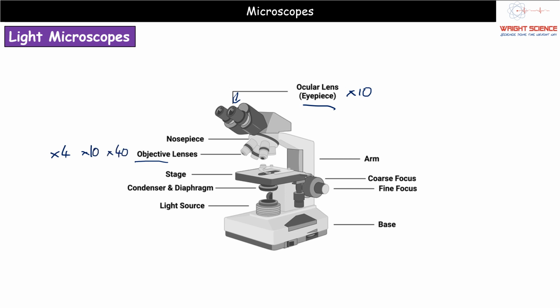They can have different ones, and particularly if you are doing things that require you to see a greater magnification, then we can obviously have more powerful objective lenses on there. The little bit that we put our microscope slide on is the stage, and hopefully you've got some decent A-level microscopes which allow you to have some little controls to move that stage around.